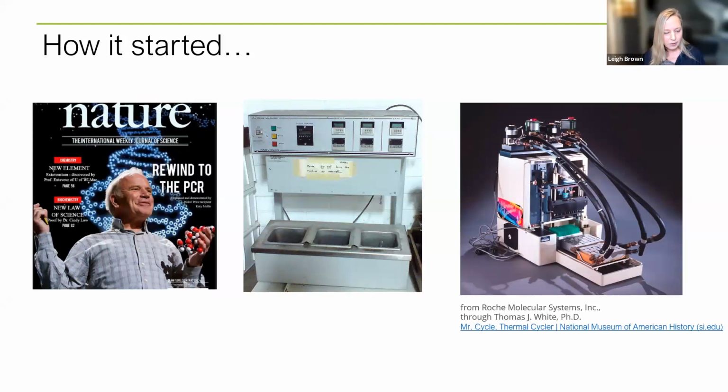In the middle here, we have one of the earliest automated PCR systems. And I have heard rumor that in some schools, teachers do this kind of thing where they have just 3 water baths. So we need 3 different temperatures, usually, for conventional PCR. And this is just an automated version of that. So it's the 3 different temperatures, taking the tubes and moving them to the different water baths. Before Taq polymerase was thought of as a way to have a heat stable polymerase, you'd have to add polymerase at the end of every cycle.